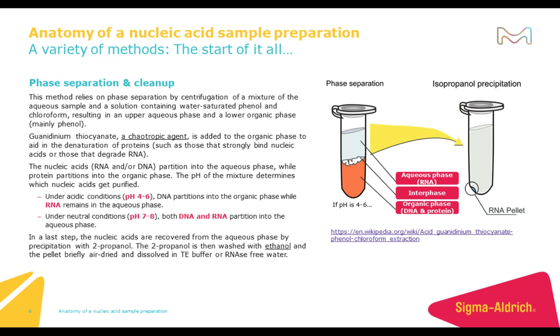These organic solvents can also impact the downstream applications, and it's kind of strange to use organic solvents to clean up organic solvents. The nucleic acid is finally crashed into a pellet using a salt and washed multiple times with organic solvents, the ethanol or isopropanol, before resuspending in a storage buffer.